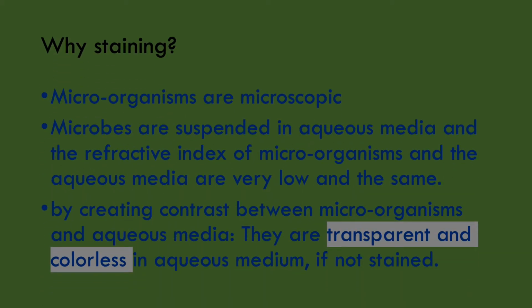First, we have to address the question, why do we do the staining? It is because microorganisms like bacteria are microscopic and cannot be observed with our naked eyes. And also, we always suspend the microbes in certain aqueous media, and therefore they are colorless and transparent in the aqueous medium if we do not stain them with a particular stain or dye. Thus, there will not be any contrast between the microorganism and the aqueous media we are using. They will look alike, hence their visualization will be very difficult.